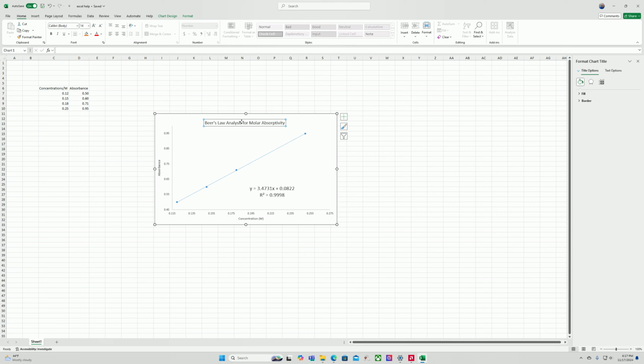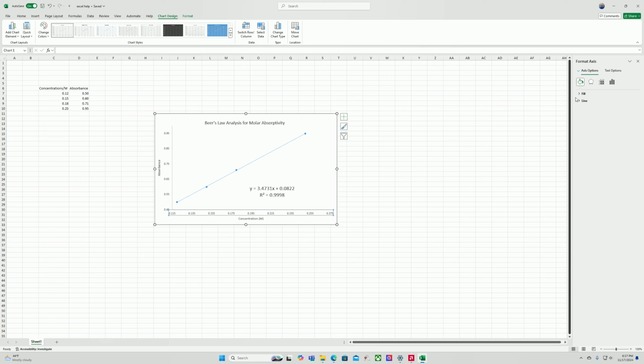So I think this is pretty good. I probably wouldn't be too picky if somebody turned this in. There's a little bit of dead space here that we could maybe get rid of and focus in on more. But you want to leave me with little opportunity to take off points for that. So that looks even better. There's nothing I could do here that would take off points.